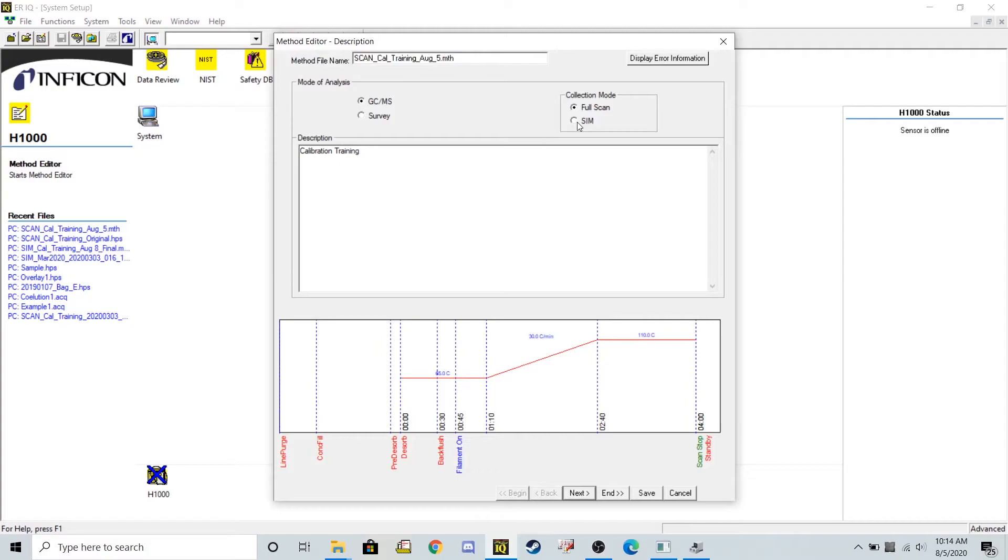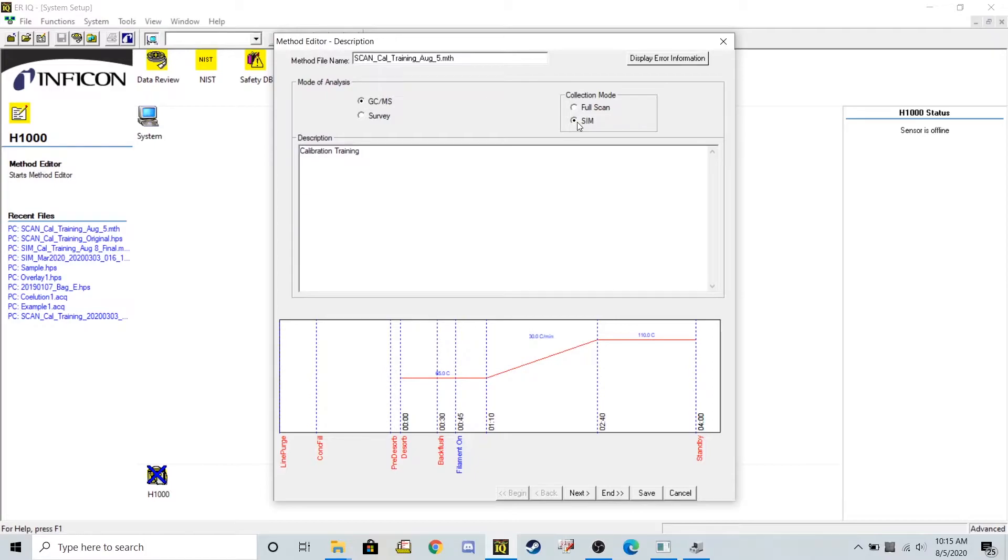I'm going to turn this into a SIM method. The advantages of a SIM method over a full scan method is you limit the amount of ions that your machine is considering. So originally the HAP site can see about 250 different ions. Each ion takes up a little bit of its time to search it.